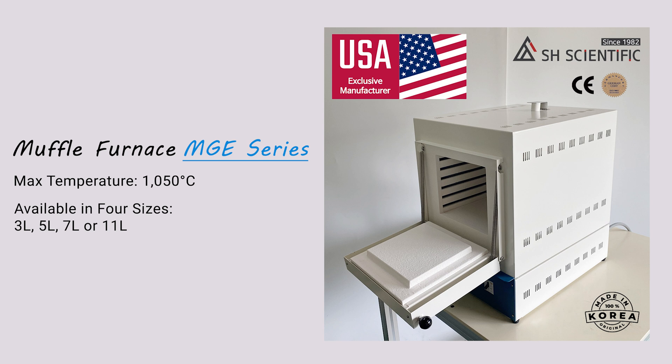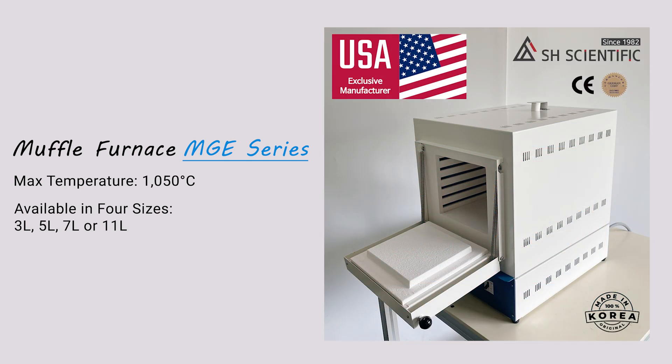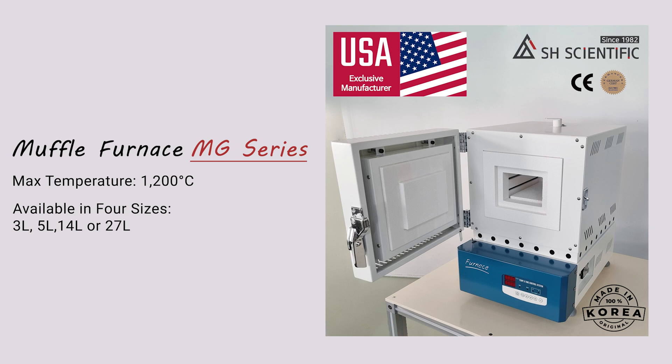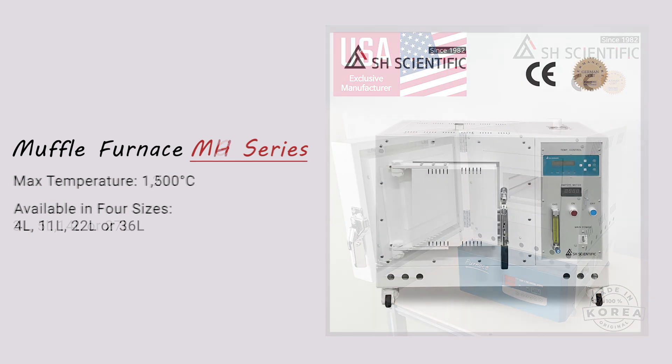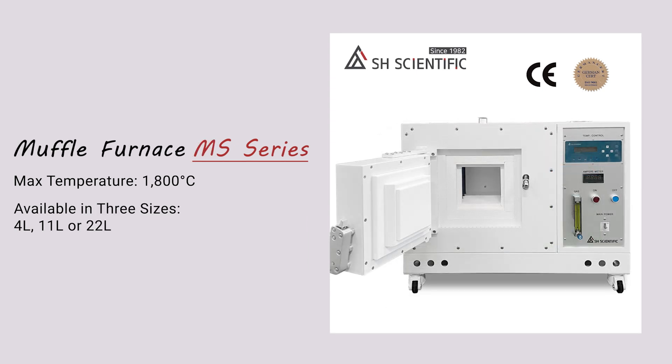All four sizes have the same digital controller temperature stability of plus or minus 1 degree Celsius. Today I'm going to feature the 3-liter version. By the way, we do have 1,200, 1,500, and 1,800 degree options outside of this MGE line.